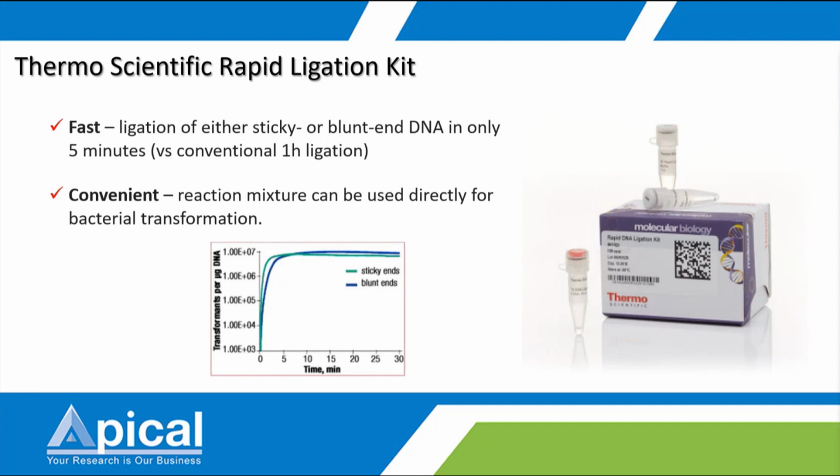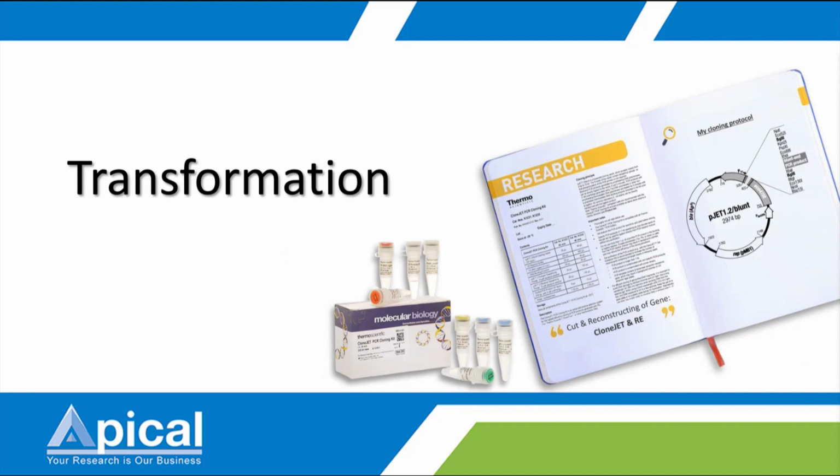After ligation, you assume that the insert has ligated to the vector, and we have the recombinant plasmid. So we need to transform it into a host cell to get more replicates of this plasmid.